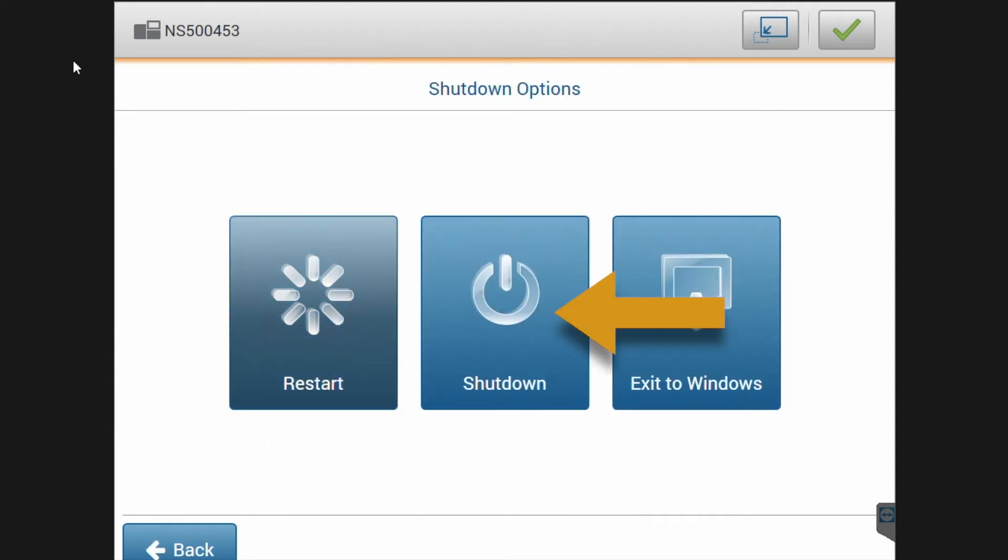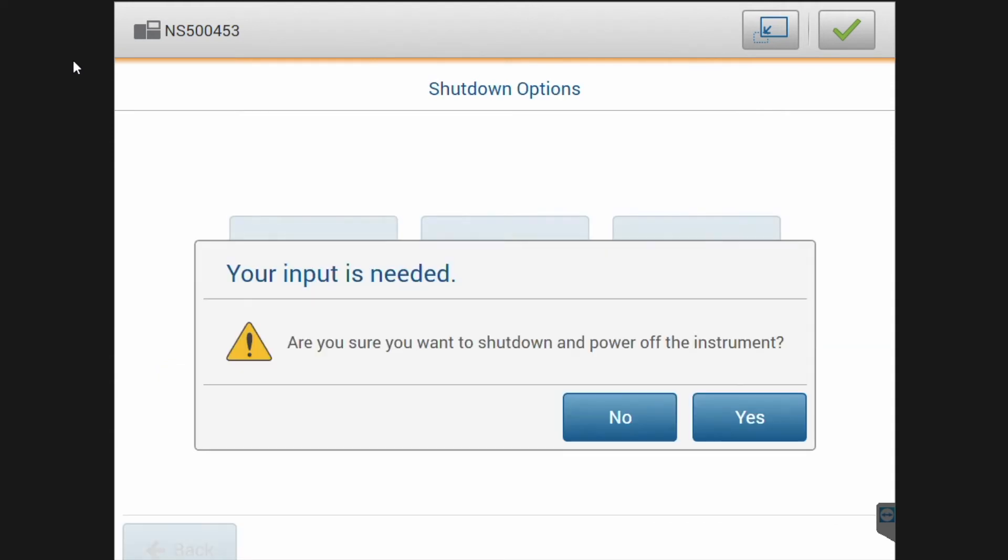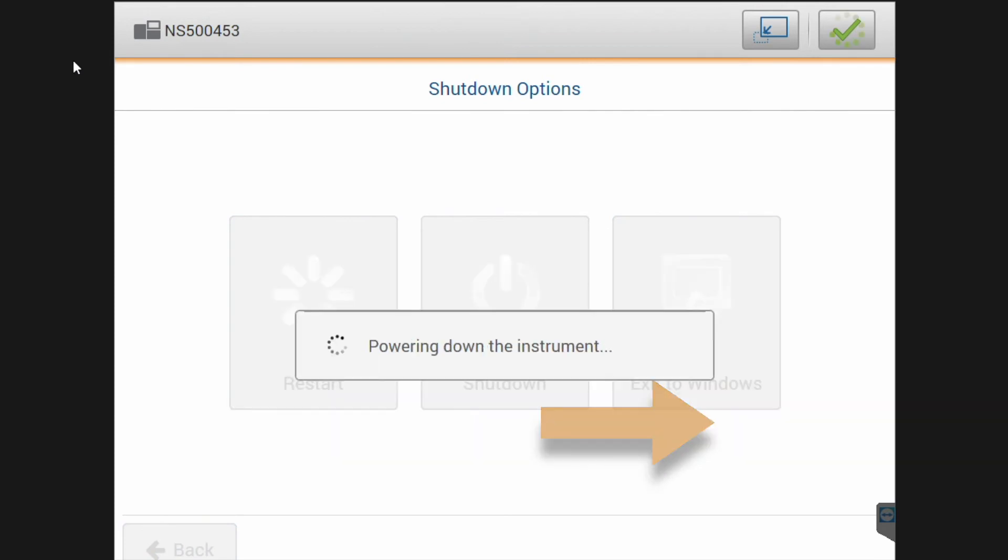Then select Shut Down to power off the instrument and confirm the shutdown in the pop-up window.